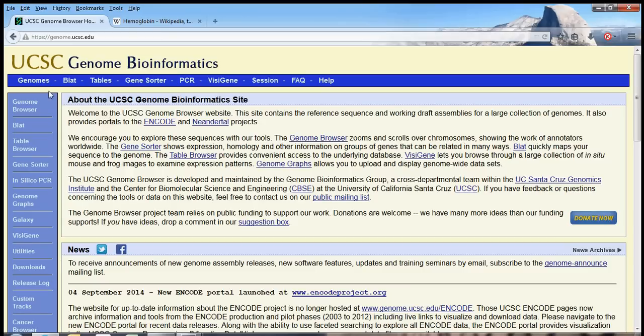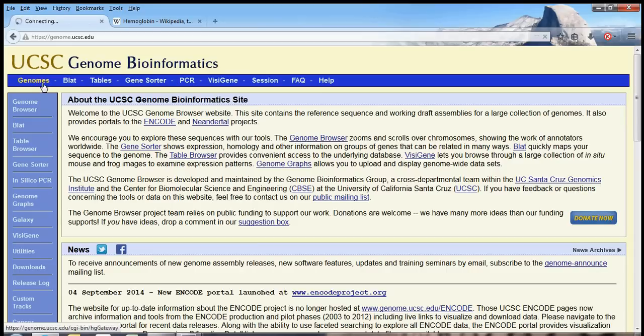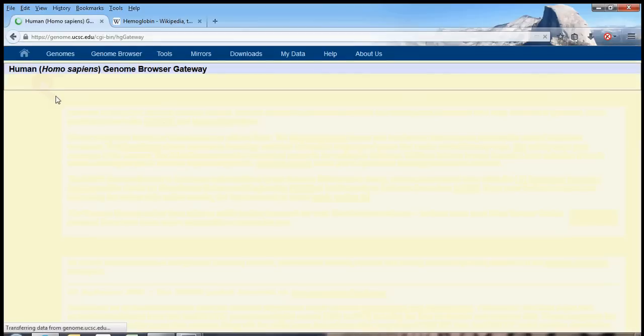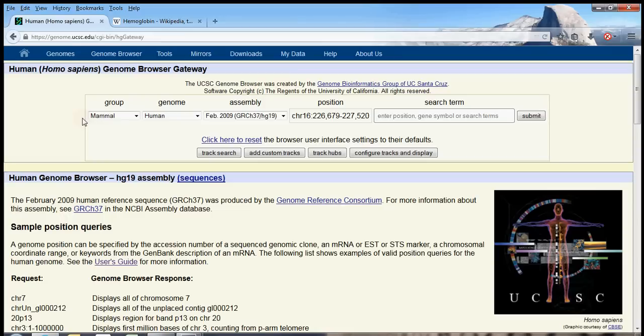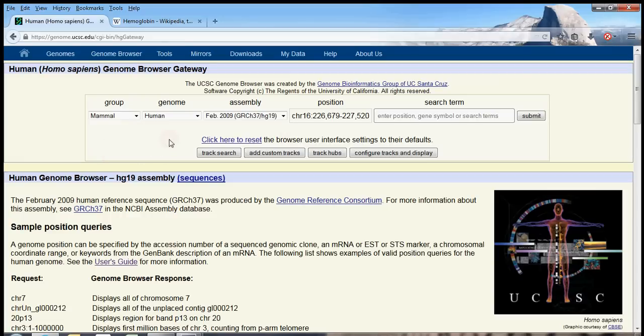So first, let's go to the Genomes tab of the UCSC Genome Browser. And here is what we find. Now, for me, the Genome Browser looks pretty complicated, but when we break it down piece by piece, we will see that it is organized quite logically. So first up here, let's direct our attention to this box. We're selecting the genome that we want to investigate.